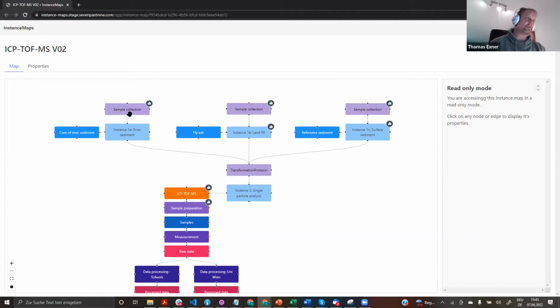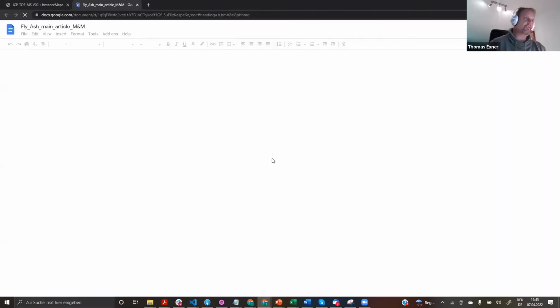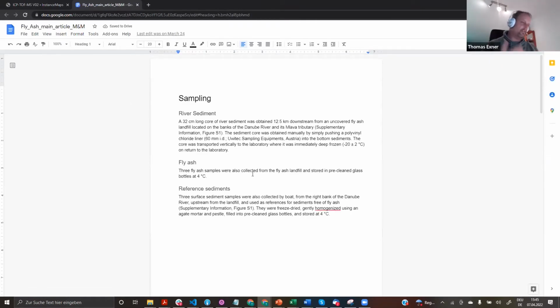This can also just be linked to a text file. It is a little similar to what I showed before with the corona study and the cadmium study, where you already have existing discussion documentation of these things, and then you can link to it.